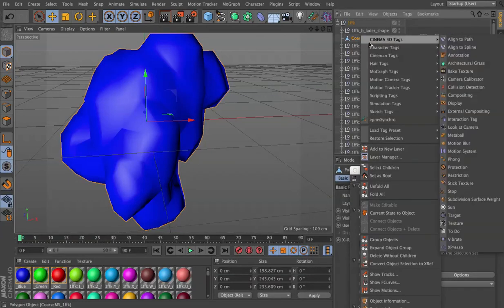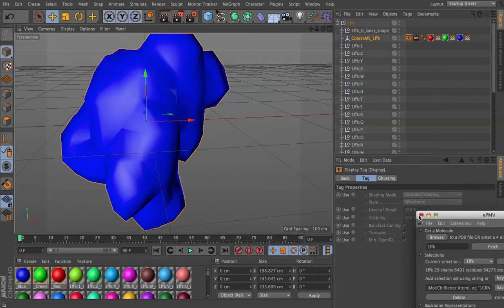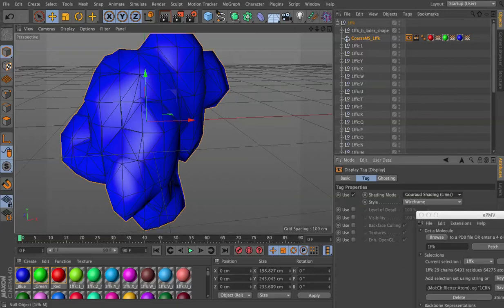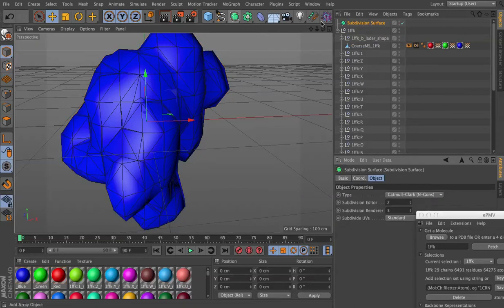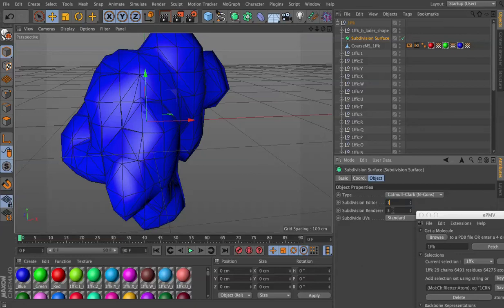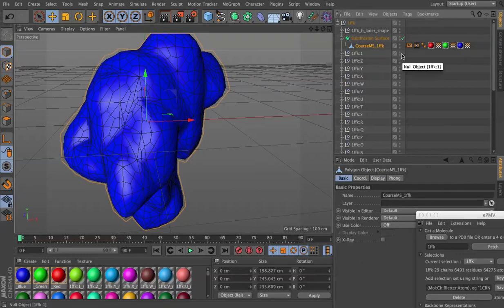I'll set a display tag so we can see how many lines we have. And then let's generate a subdivision surface. Knock that down to just one. And drop that coarse molecular surface into it.